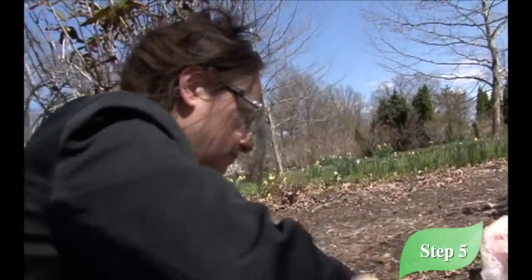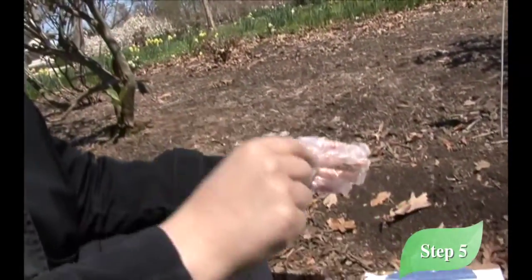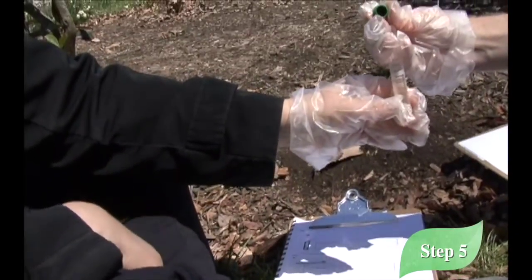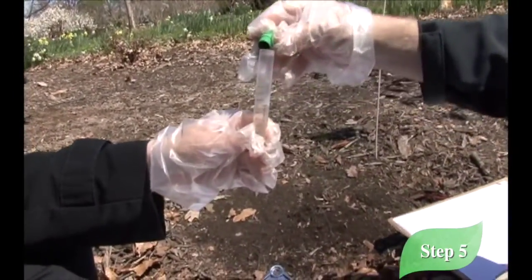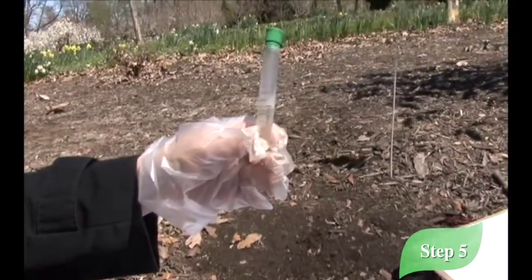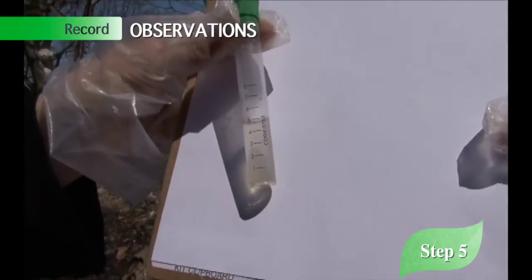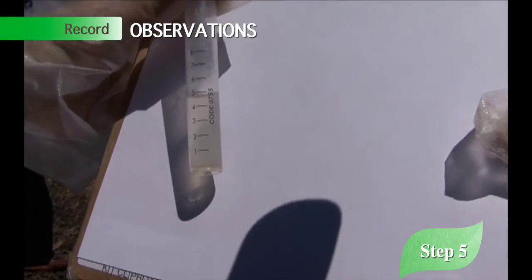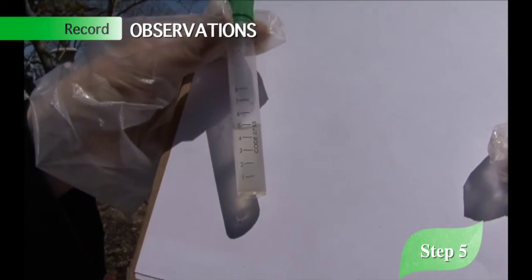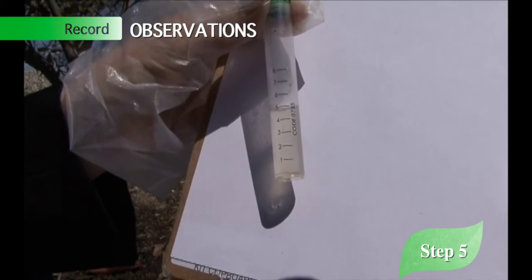Okay. Before we recap it, didn't we have to write down observations? Oh, yes. Let's write our observations down. What do we notice about the liquid? Let's see. Looks pretty clear to me. Yeah. Just maybe a little bit cloudy. But it's not any specific color, really. It's just like a clear tint. Cloudy white, a little bit.